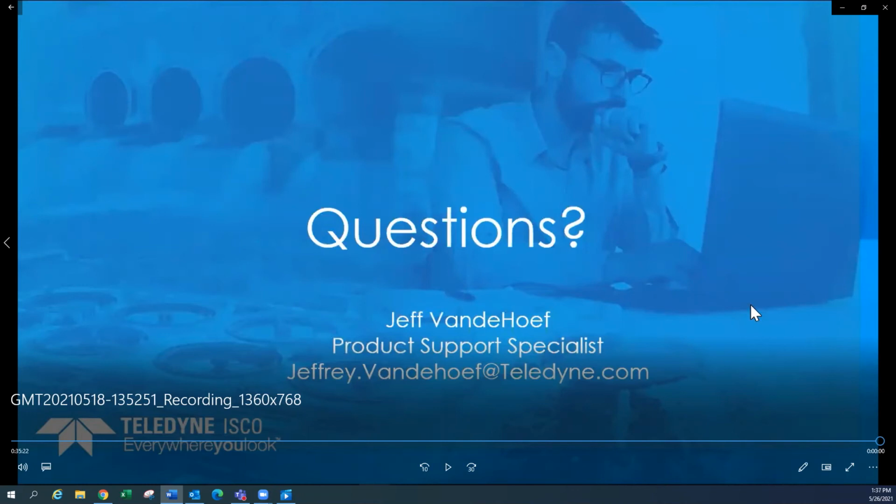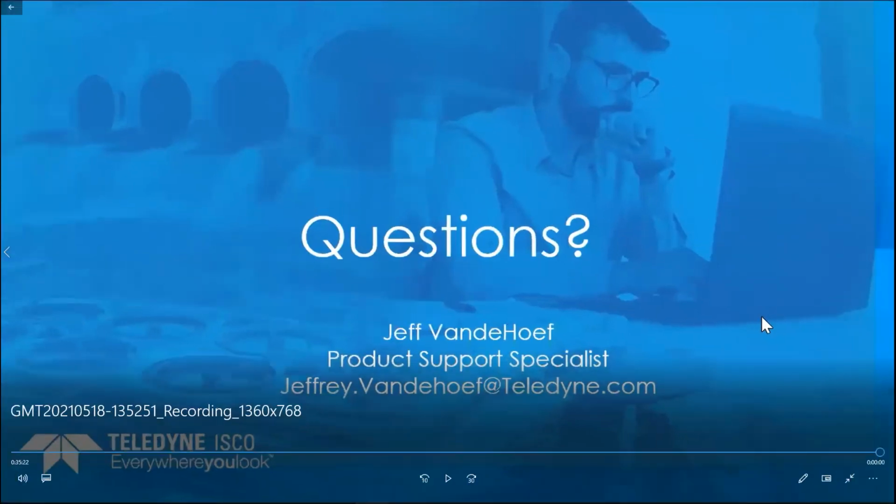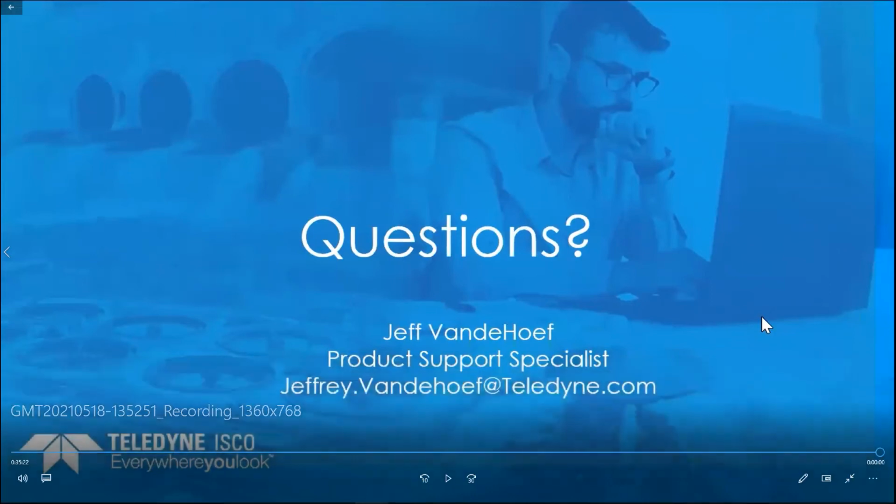There are other options of samplers that I didn't really talk about in the presentation. It's called a vacuum sampler. Vacuum samplers don't have a mechanical mechanism with tubing in it. There are no mechanical parts on it. It's just like a vacuum pump, and there's a solenoid that switches between vacuum and pressure in the line.